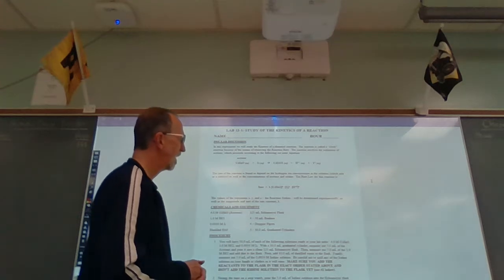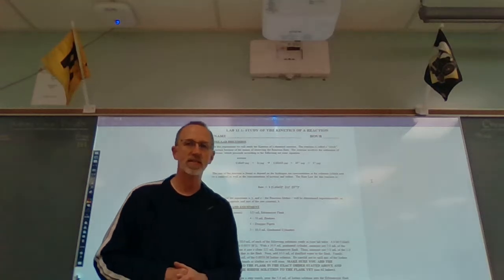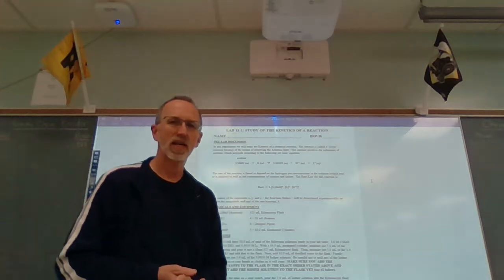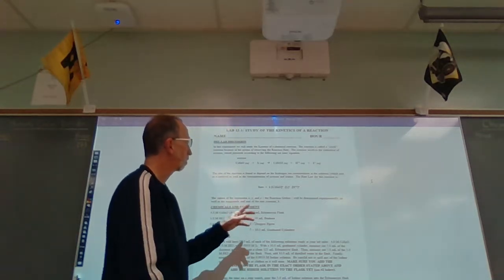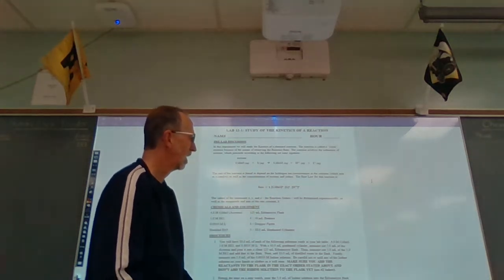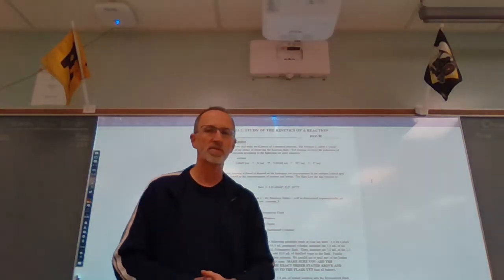So the reaction involves the iodination of acetone. So this is acetone, C3H6O. That is a common name that is used a lot. The actual correct organic name is propanone, which is our smallest ketone. And so our reactants are acetone or propanone and iodine. And also we have a third reactant, HCl, which is the source of hydrogen ions that you see here. This reaction has to occur in acidic solution in order for it to happen.